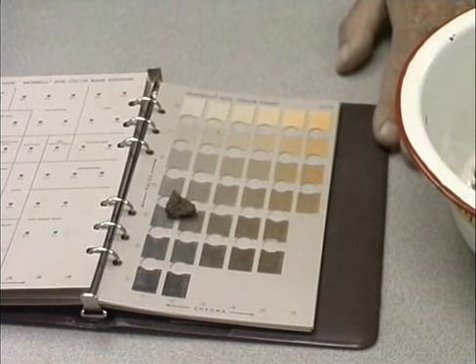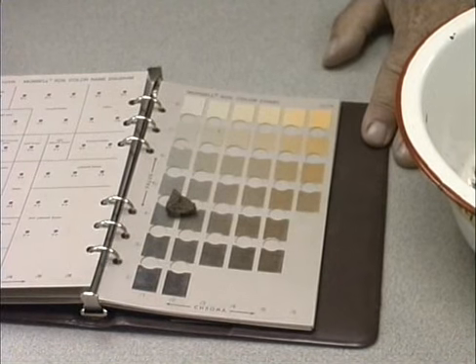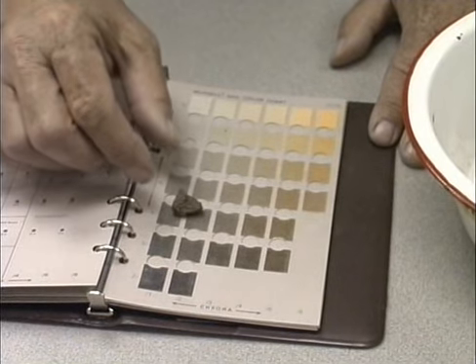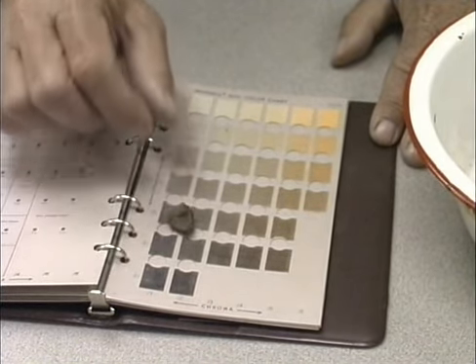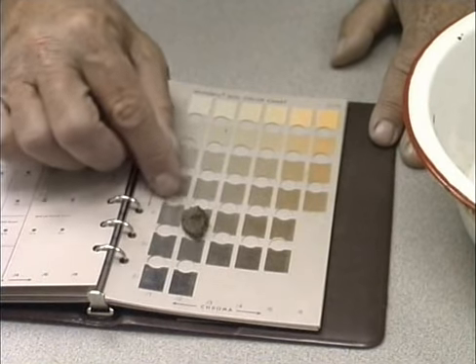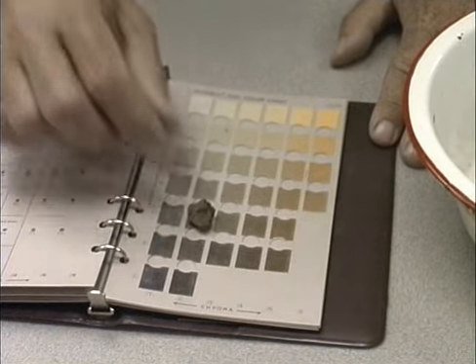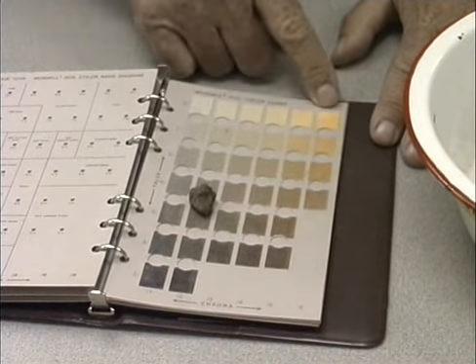Once again, soil color, or the color of these peds in relationship to these plates, is a matter of interpretation. Not all people see color the same. There's quite a bit of variables there. I see this particular sample as falling somewhere between this plate and the one below it. If we call it this plate, we're back to what we were on sample number 1, a 10YR 4-2.